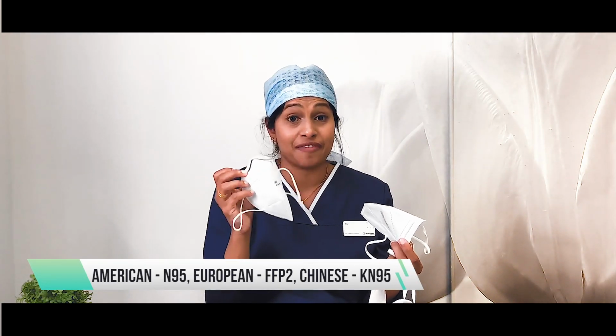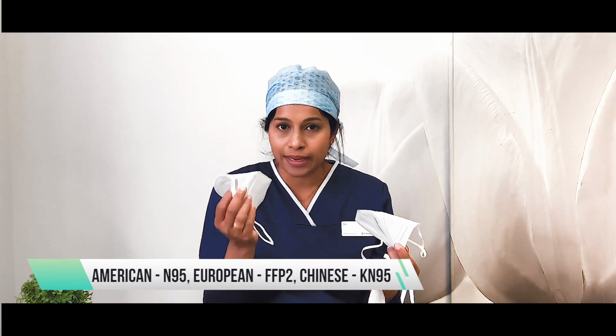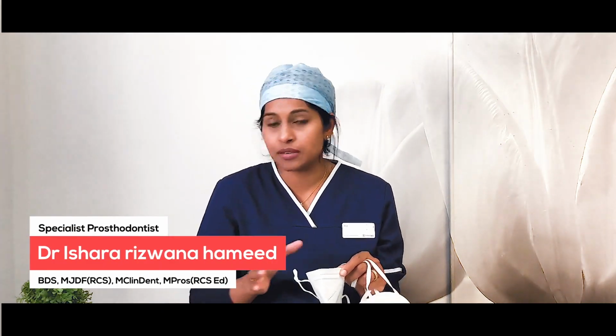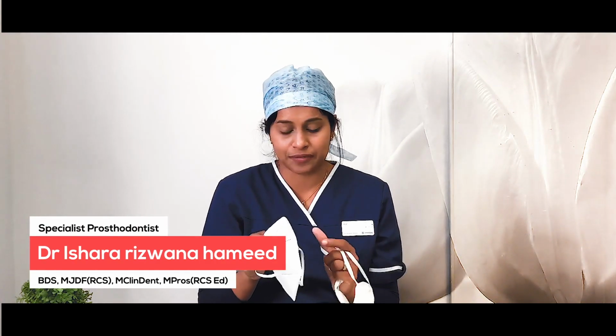Now these are all N95 or FFP2 equivalent, so that is the recommended guideline for any AGP procedure, but these have to be fit tested to make sure that it protects you to the correct level. I have had a few fit tests, and I actually didn't pass any of the fit tests on any of the FFP2s or N95s.